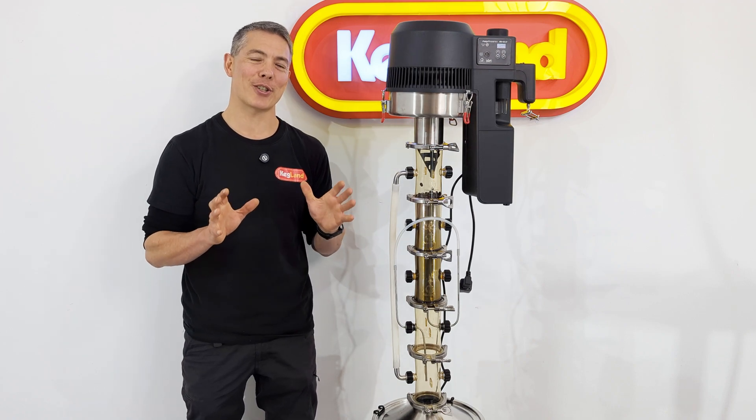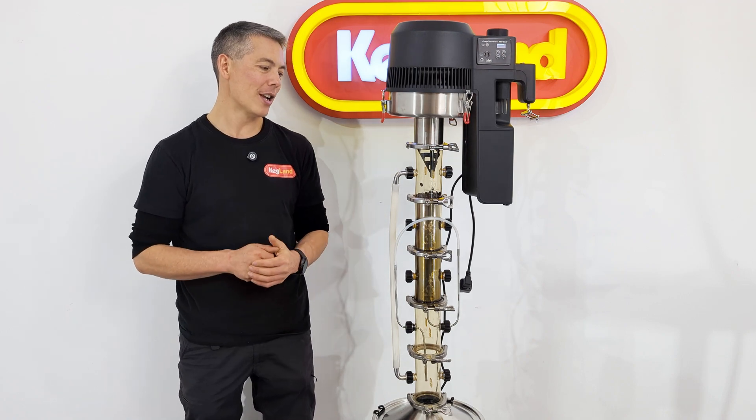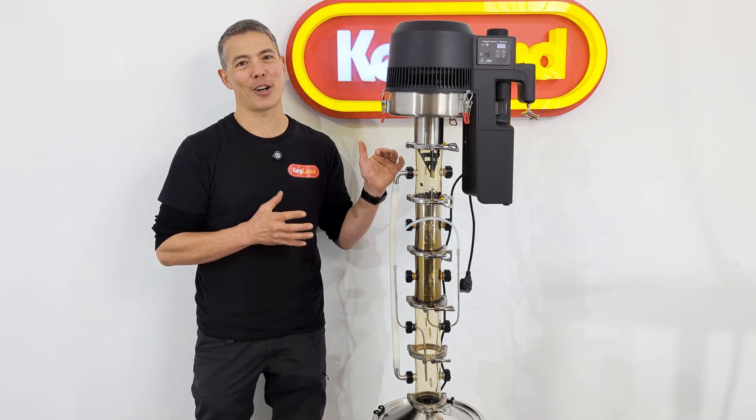Hey guys, Kevin Keighlin and today we're doing a Soxhlet extraction process. I've chosen to do coffee beans today.